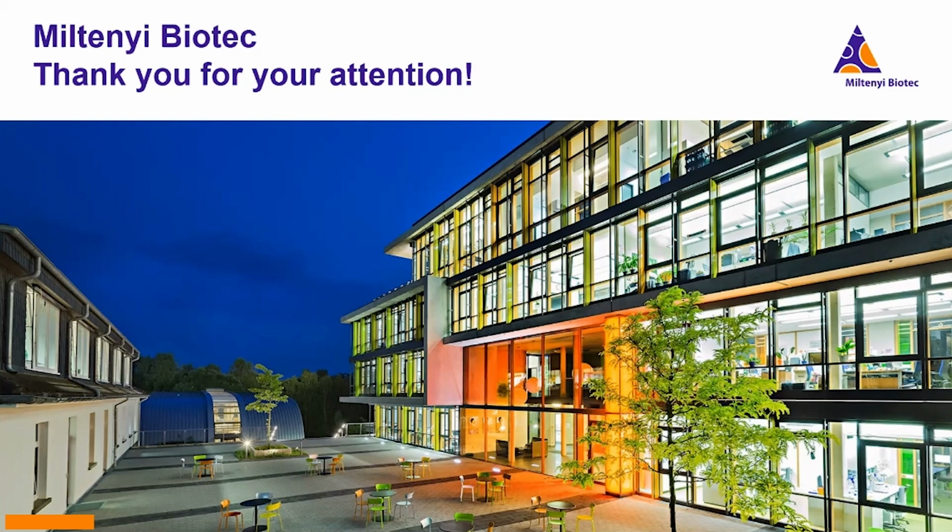Okay, this is interesting. If I am working with zebrafish, do the anti-nucleus microbeads also work for this species? Yeah, that's a very interesting question. Since we don't have these types of tissue available at our facility, we cannot say that we have internally validated it.